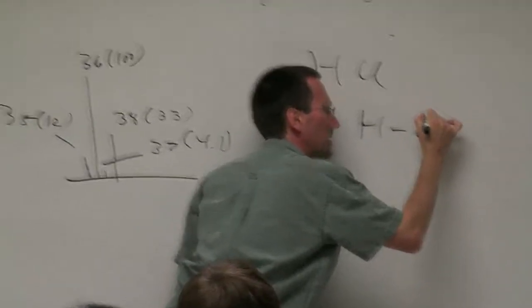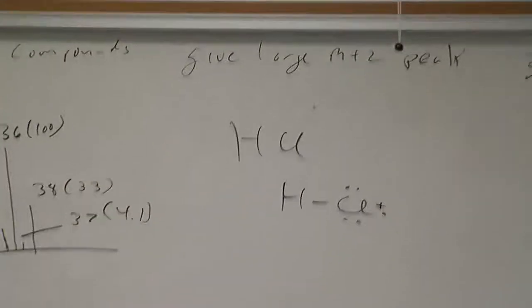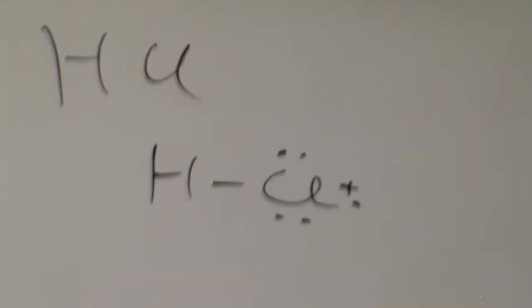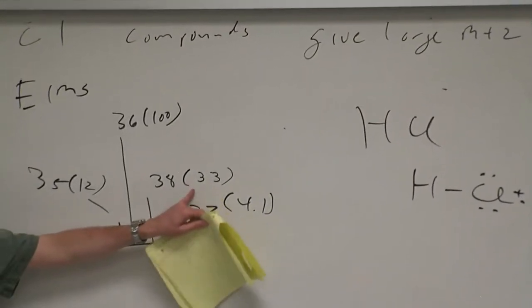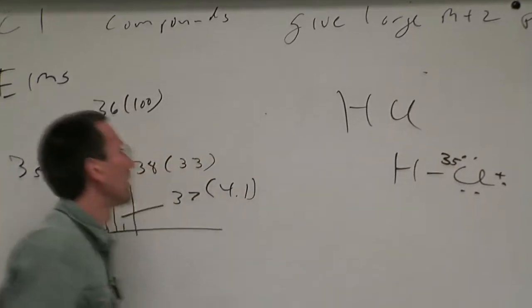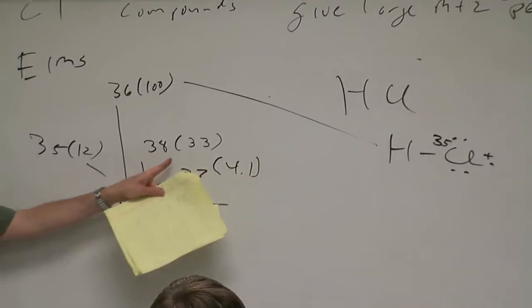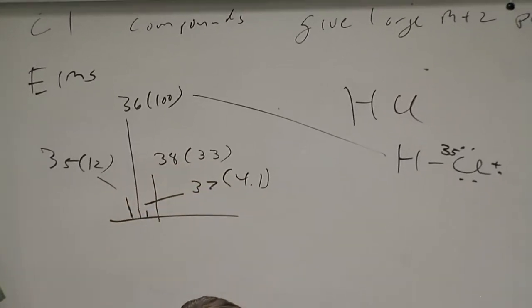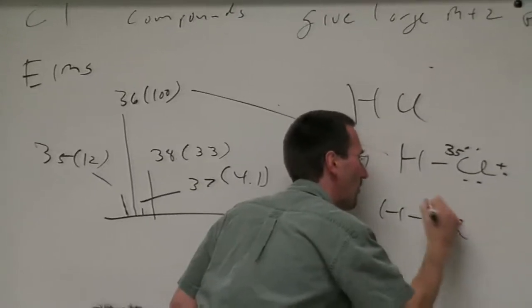And if you remember, I said that the way you generate a molecular ion, we'll talk more about fragmentation, but in the EI mass spec, the way you generate a molecular ion is to kick out an electron. Okay, what about this peak here? So that's the 35 peak. That's the Cl35 peak. So what about the peak at 38? That's the 37 one.